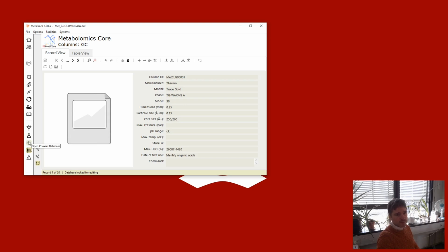Database types, a particular primer sequence, these analytical columns and safety labels and things like this. So these are sort of useful resources, whereas these can contribute directly to those experiments. So with these, perhaps you can also start to see how these connections can all come together. So when we're going from a strain to a culture to an extract, and then that can come all the way back around to a publication. So that way we can get a whole overview. Say if we're starting at the publication, we can get a list of origins.